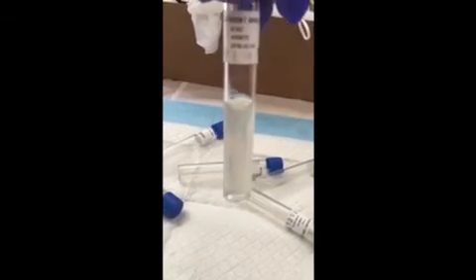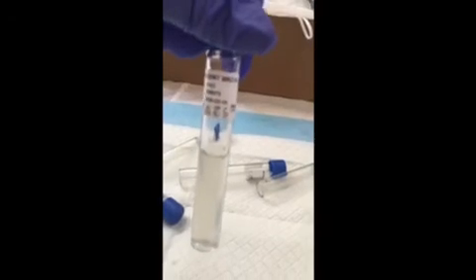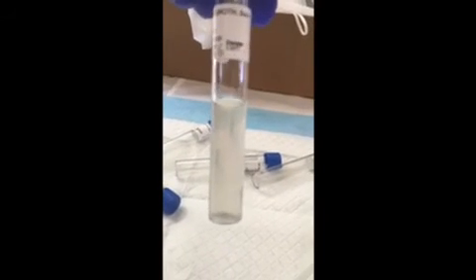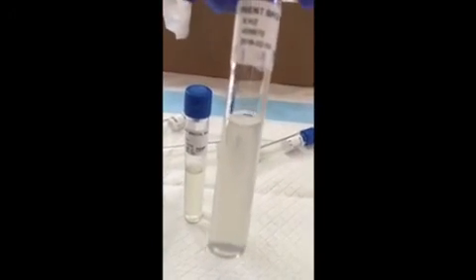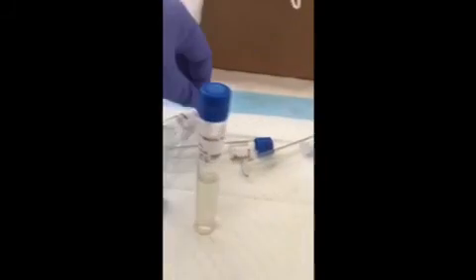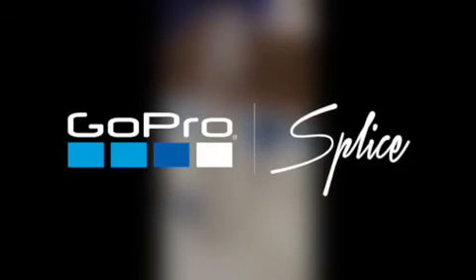So turbidity, all of these are positive. This is for the Cerevisiae 5%. It doesn't matter if it's 5 or 9, they're all positive.